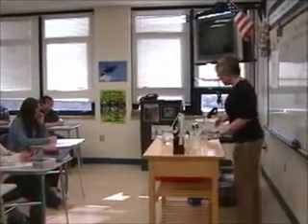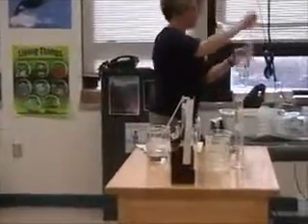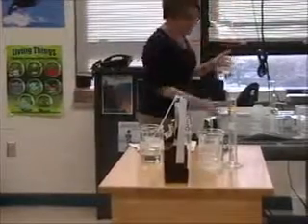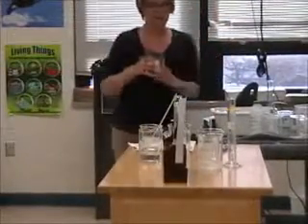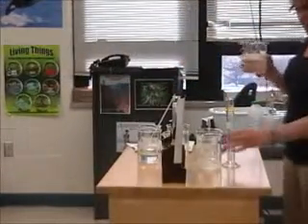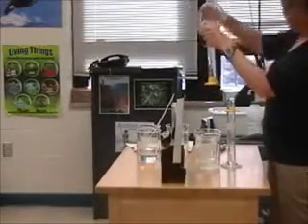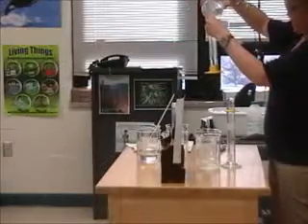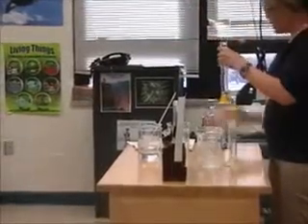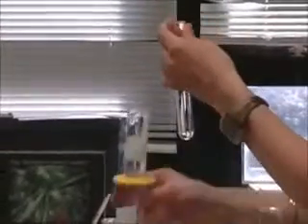All right, so now let's take a colder solution, which is over here on ice. This is right about 5 degrees Celsius. So this is quite cold. Remember that 0 degrees Celsius is freezing. This is actually going to warm it up a little bit because the test tube's kind of warm. Try to get it out here fast. Okay, that feels very cold.